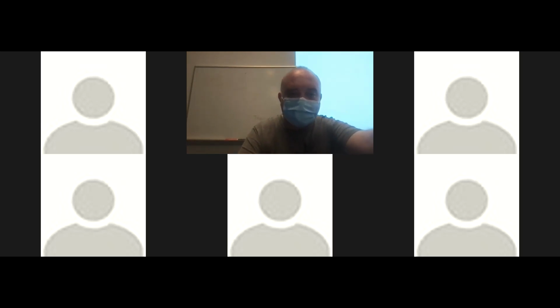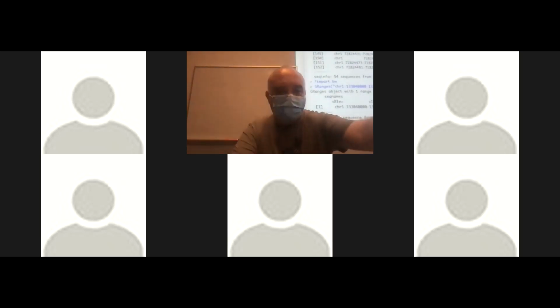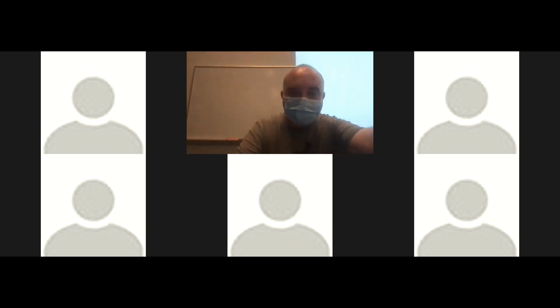to there. I think we could also just do it the very simple, easy way as well. I'm not sure why I don't. Remember, we can actually create GRanges directly from that kind of setup, where it's chromosome, colon, position start, position end. So we could have done that rather than create it so explicitly here. But we need that GRanges so that when we import the signal, we can set the selection.